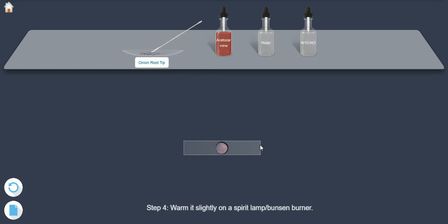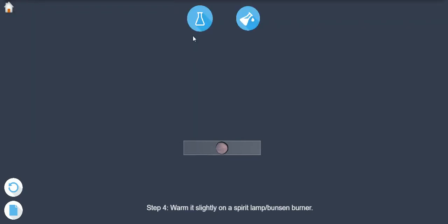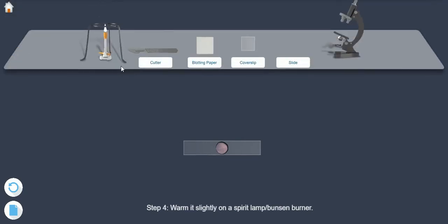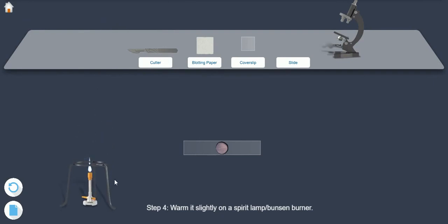Step 4. Warm it slightly on Spirit Lamp or Bunsen Burner.